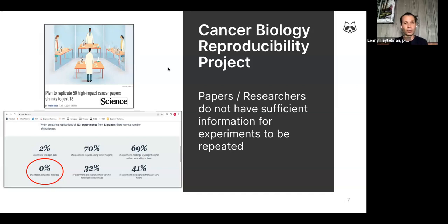And the reason this is so striking is that we always think about the insufficient method details in the published papers, like in the tweets that I showed above. But the reality is that the papers are sort of this external reproducibility, but the challenge with repeating work comes long before the publication, inside our teams, inside the laboratories, in terms of how we're tracking and organizing the methods, and that's what I call internal reproducibility.